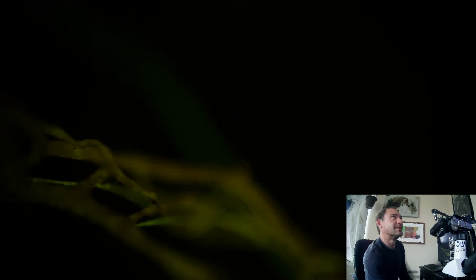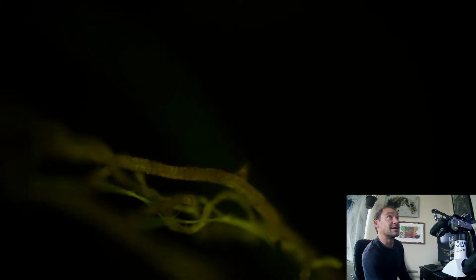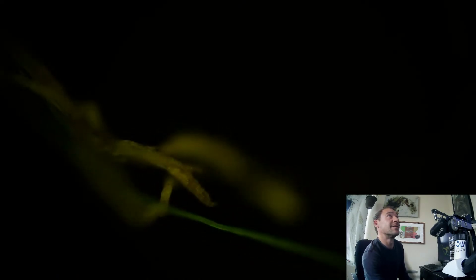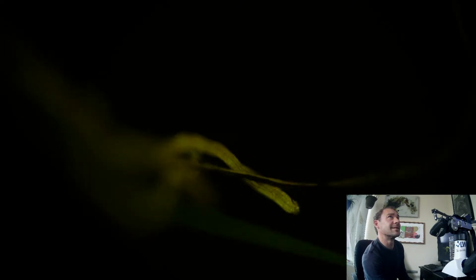Wow. Yeah, I was surprised. I pulled out this native blueberry that grows wild here in New England. And it was impressive how many little root hairs are on this one little root. Very different looking from the other roots.